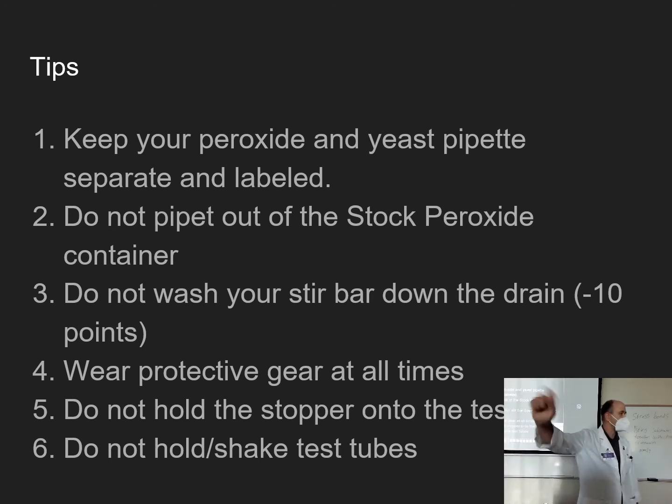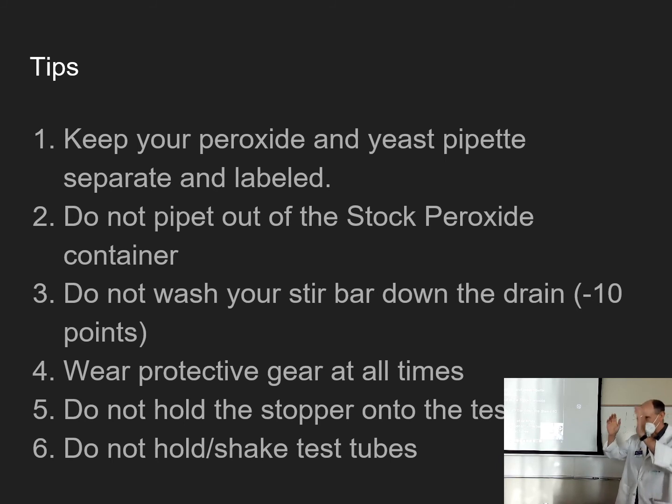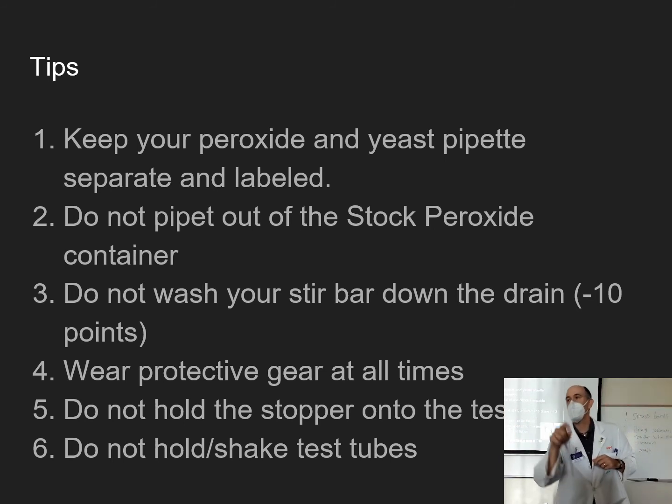And don't hold or shake the test tubes, because that adds heat from your hand, which changes the variability of the results. We're adding more variables. And it adds motion, which increases the rate of the reaction also. So all the reactions are going to take place in those test tube stands that you have. I see one there, you got one there. Hopefully they're all out. The reactions will take place in those stands. Okay.